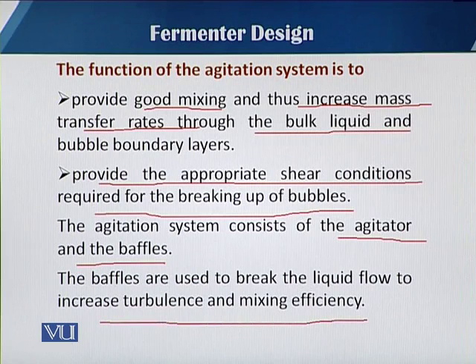As we have seen in our daily life, when we are making syrup or a milkshake at home, just look into the bowl. There is an ingrowth, and that ingrowth is basically known as the baffles. Sometimes we put a spoon inside just to create more turbulence. If there is no baffle, what happens?